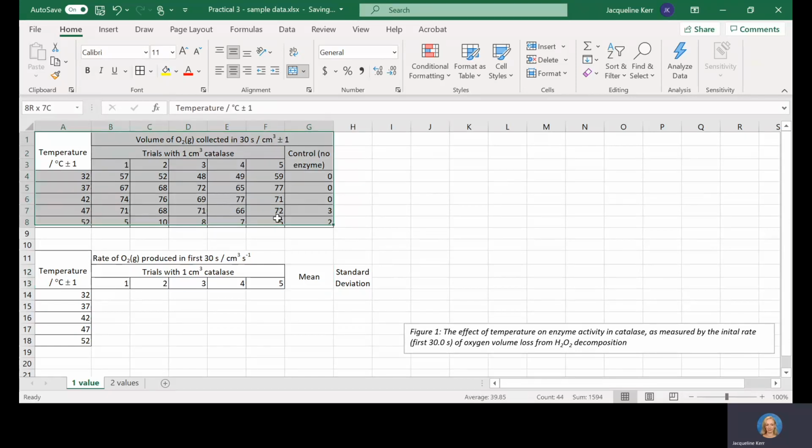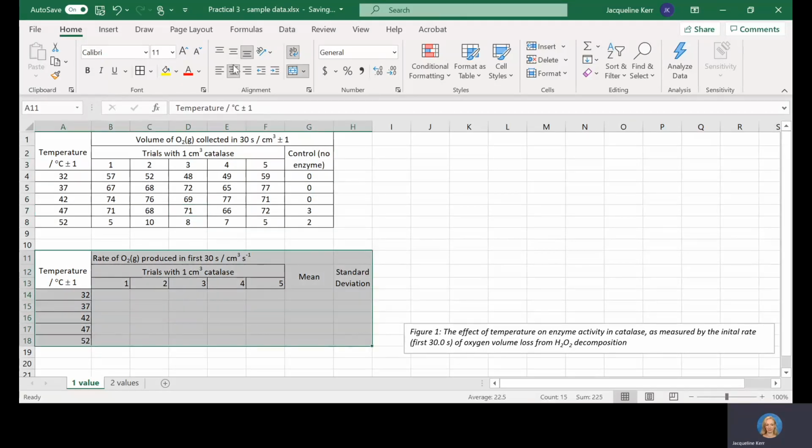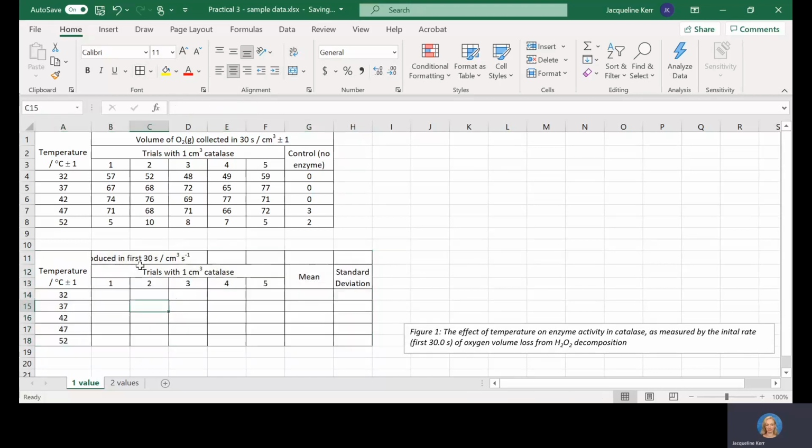If you prefer, you might want all your values, for example, centered. Often when you see IB exams, that's just their style preference. They put them in the middle, it doesn't matter. But I'll just do that. Might as well be consistent. I've sort of copied this layout from an exam question, the way they would do it.